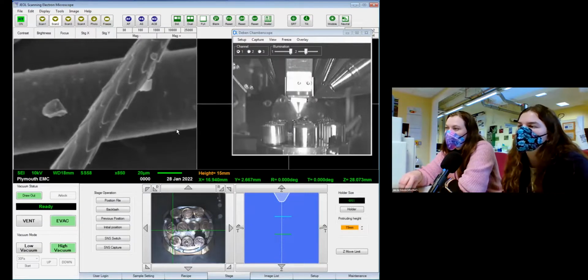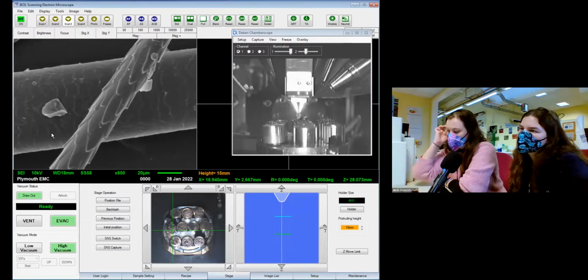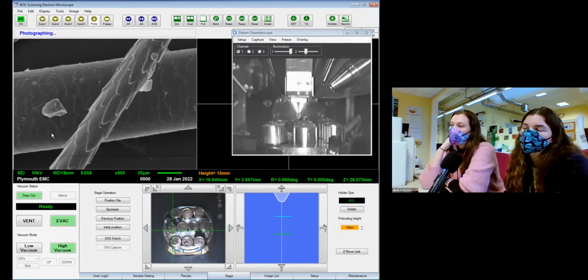Because we've got 3-dimensional samples now, getting the focus on them can be a bit tricky, because trying to focus on something that's in front of another piece is hard. That's not bad, I don't think. Even those two hairs look different, because that's further back and much bigger. I wonder if she's got a double layered coat or something. That'd be pretty cool. Very different to the horses.